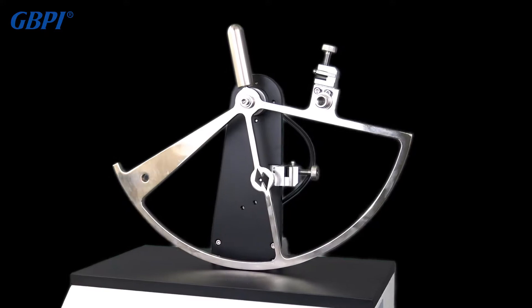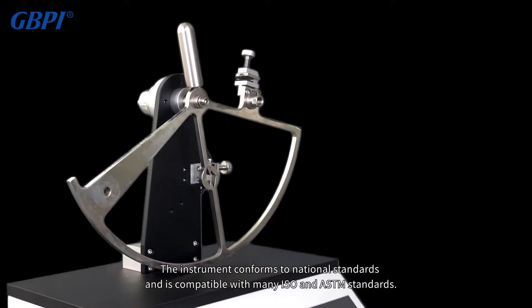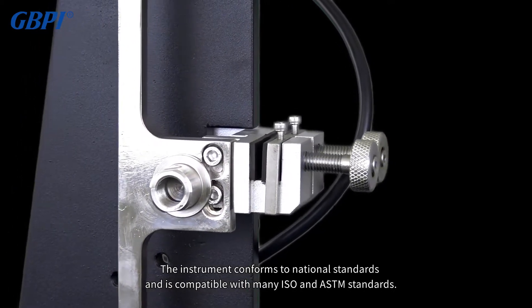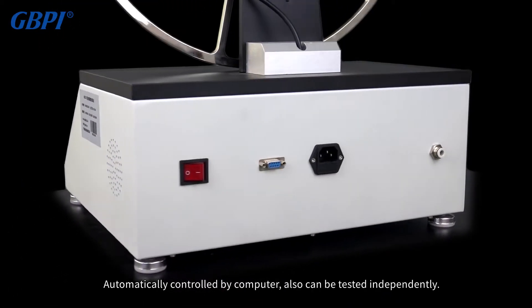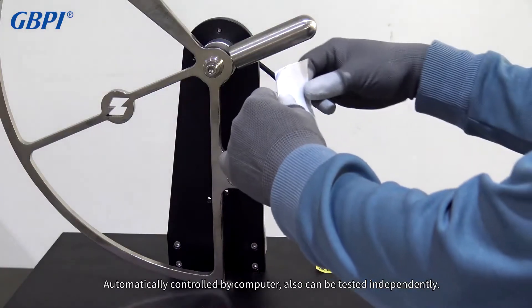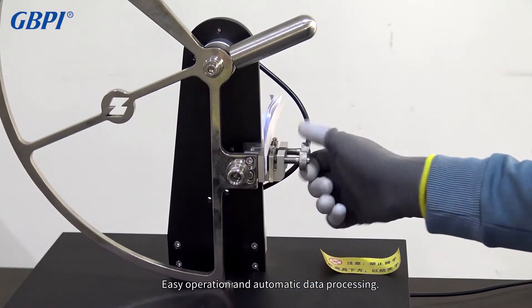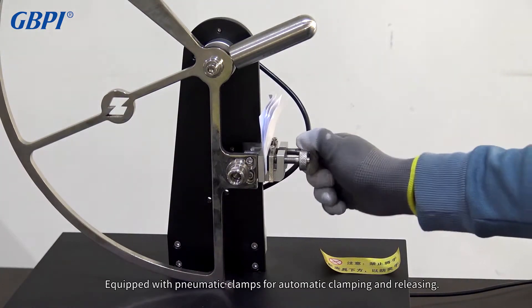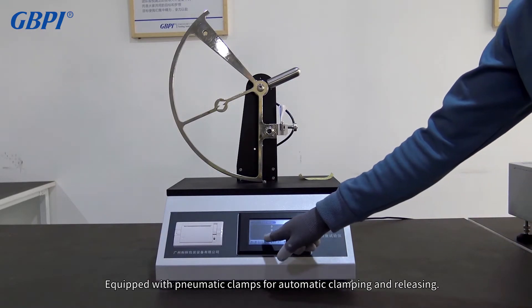The instrument conforms to national standards and is compatible with many ISO and ASTM standards. It is automatically controlled by computer but can also be tested independently. Easy operation and automatic data processing, equipped with pneumatic clamps for automatic clamping and releasing.